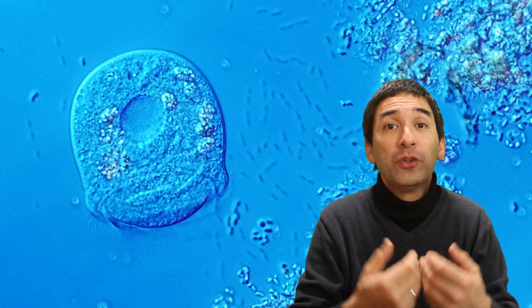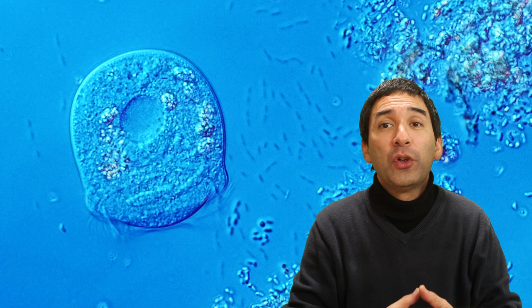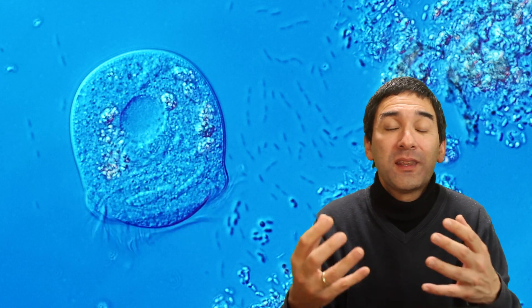Now, one of the things that is really evident here is, in this video, is the enormous size difference between the bacteria and the ciliates. The ciliates are not only much larger, but they're also significantly more complex than the bacteria.